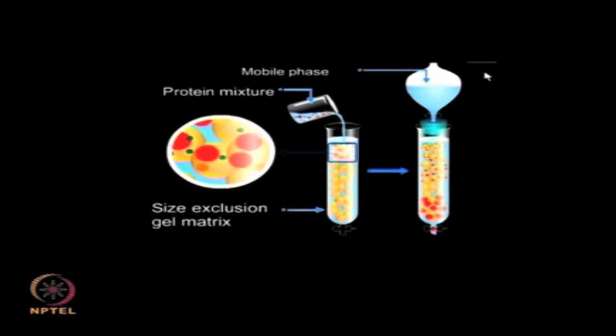of the column. Mobile phase. The proteins are eluted out of the column by using a suitable mobile phase that carries the protein out for elution. For gel filtration, a salt solution of appropriate strength is commonly used, so that it will not have any effect on the properties of the proteins being purified. Solvents or buffer systems are often used in other types of chromatography.